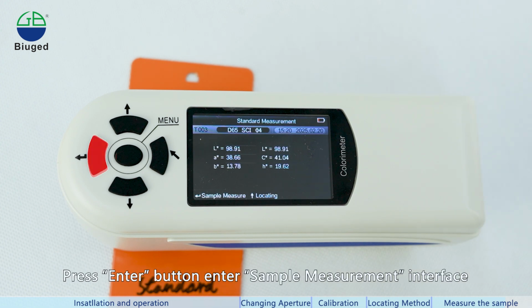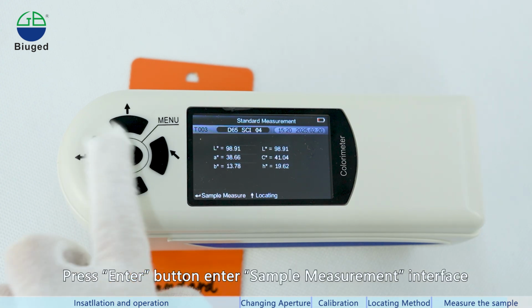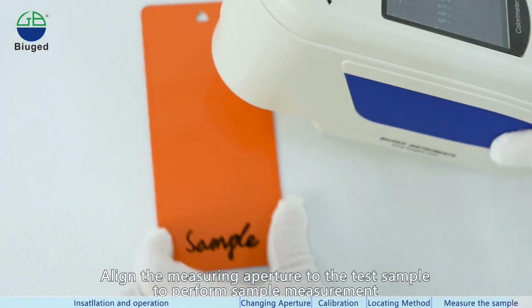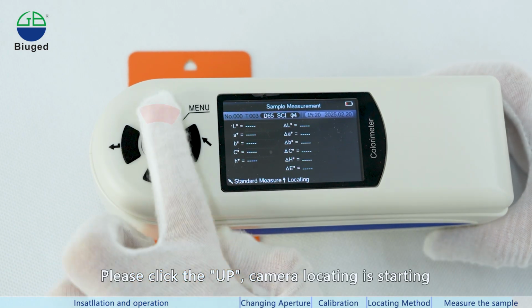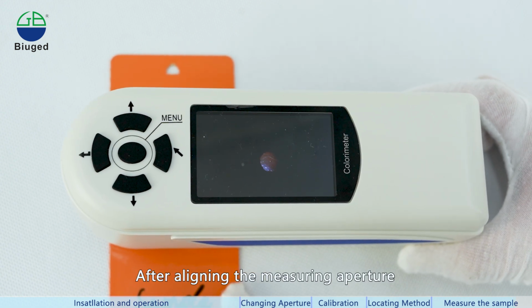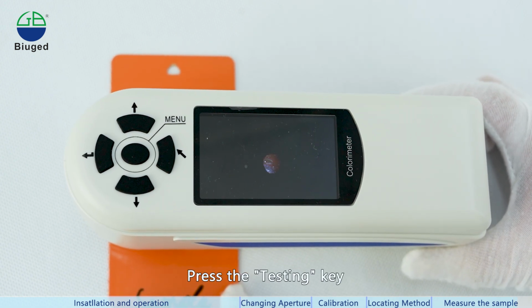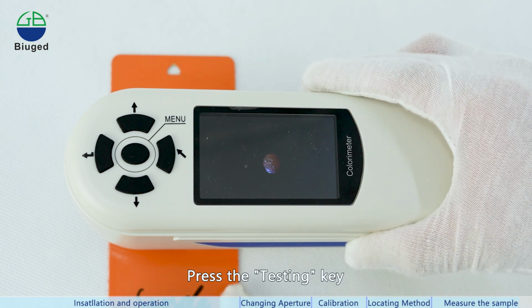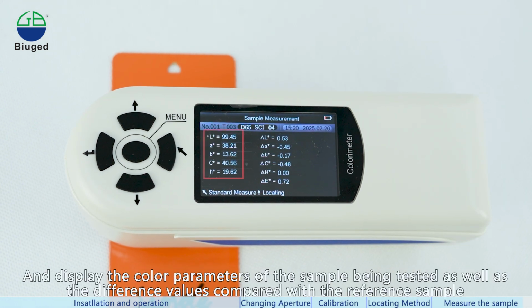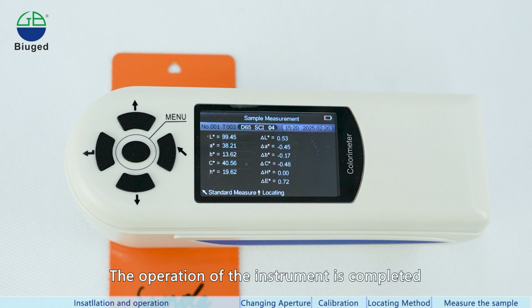Press the Enter button. Enter the sample measurement interface. Align the measuring aperture to the test sample to perform sample measurement. Please click the up button. Camera locating is starting. After aligning the measuring aperture, press the testing key and complete the color measurement of the sample within 2 seconds. And display the color parameters of the sample being tested as well as the difference values compared with the reference sample. The operation of the instrument is completed.